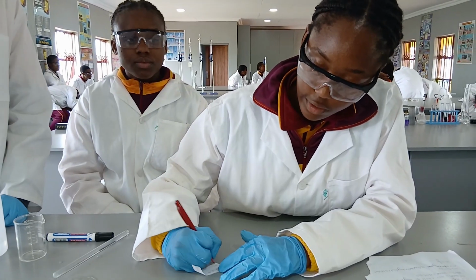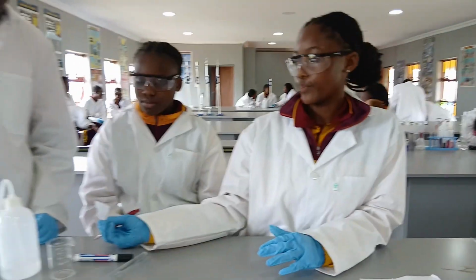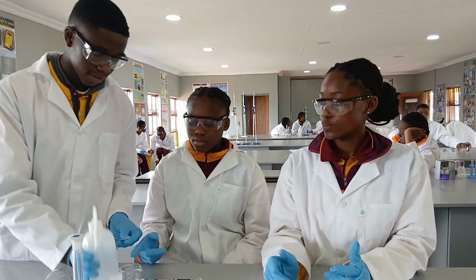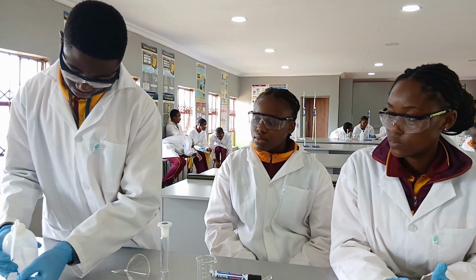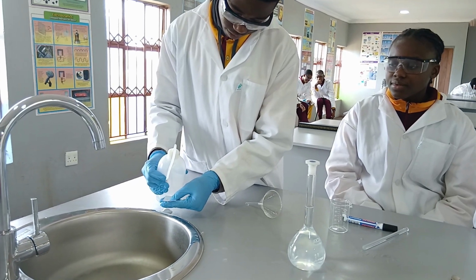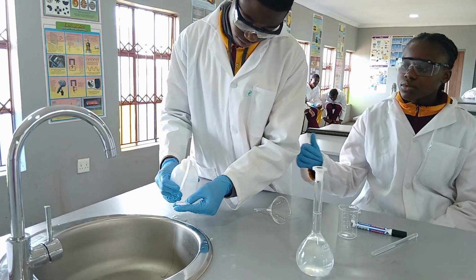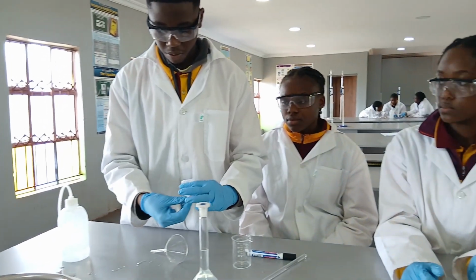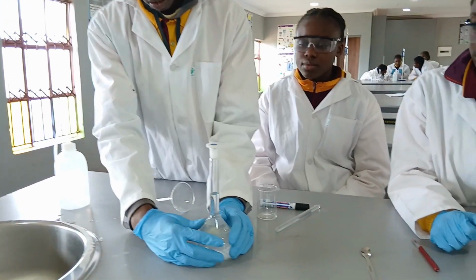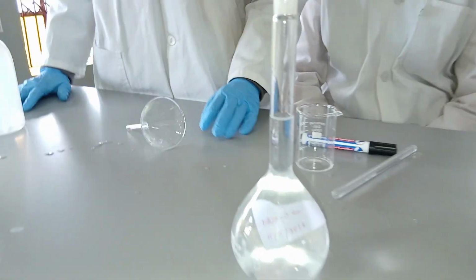The date is the 11th of November 2025. Wet the paper. Then this experiment will be done.